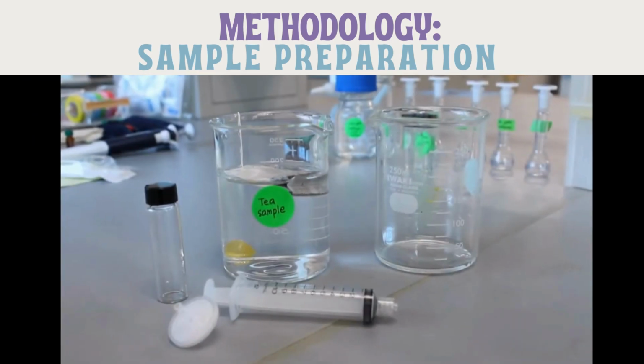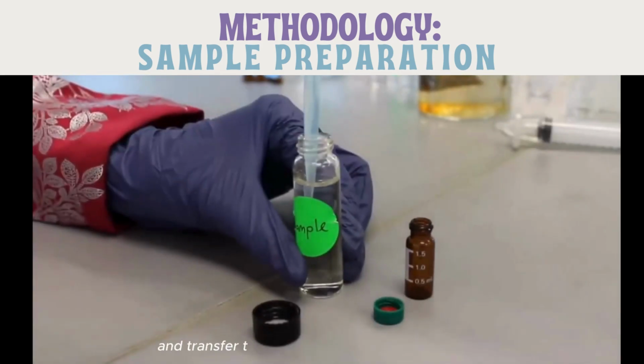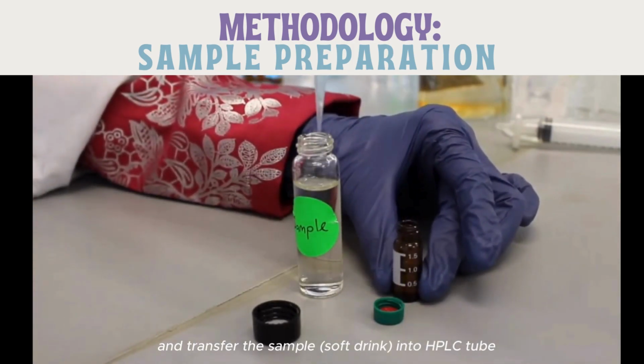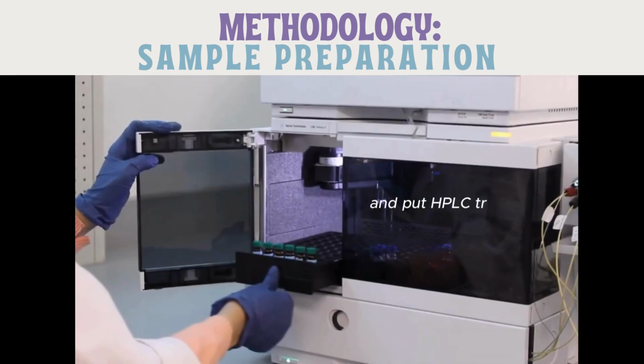Next is for the soft drink. As I mentioned before, the sample was changed from the tea sample into the soft drink sample. So the soft drink sample was filtered into the glass tube using the syringe and the filter, and the sample was transferred into the HPLC tube. The samples with different concentrations were obtained and transferred into the HPLC tray like this. Then, put the tray into the HPLC machine for the next method, which is injection.